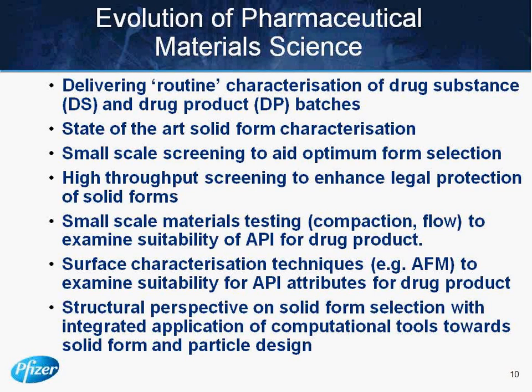When I first started, what we did, I think, was deliver relatively routine characterization of drug substance and drug product batches. We ensured the quality of what was being generated. What we did then, I think, was invest in better characterization, whether it's by powder X-ray diffraction, single crystal X-ray diffraction, or thermal methods. We then started to think about automation and robotics to allow us to search for different solid forms and indeed introduce intellectual protection associated with it.